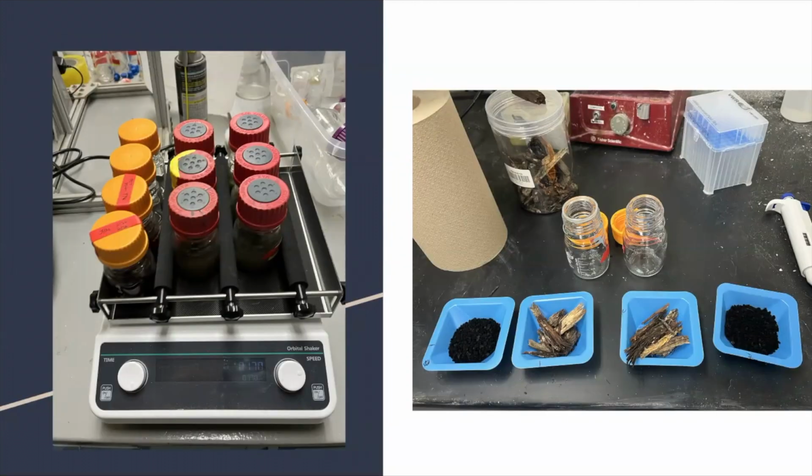Next, a sample of mulch was collected from outside of Snihao. For the experiment, 2 groups were created. The first group was mulch that weighed out to be 9.007 grams, and the second group was GAC that weighed out to be 9.001 grams. Then we obtained 2 containers of 16 milliliters of red dye with 15 milligrams per liter concentration.